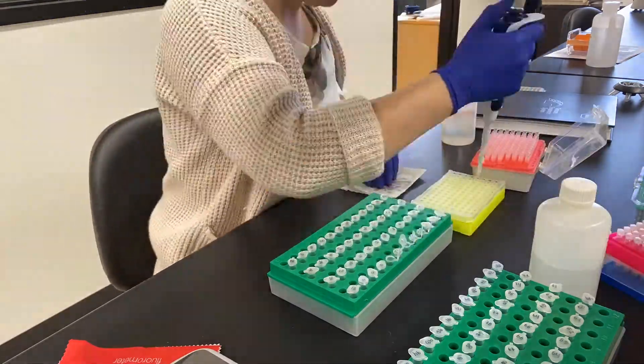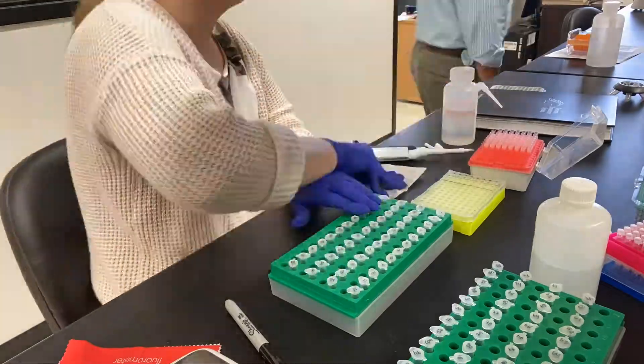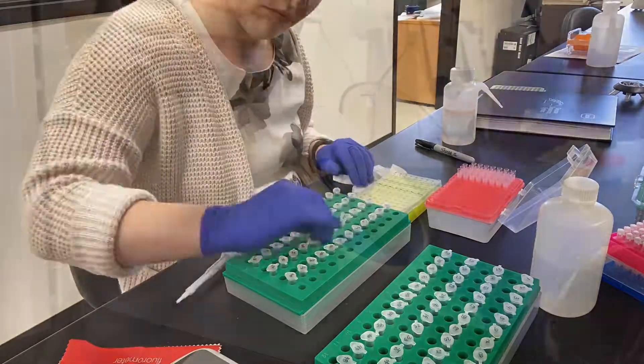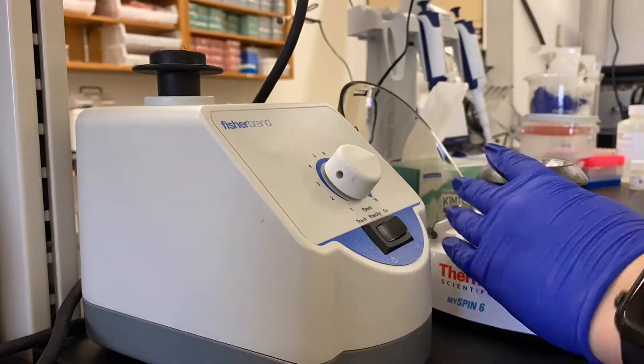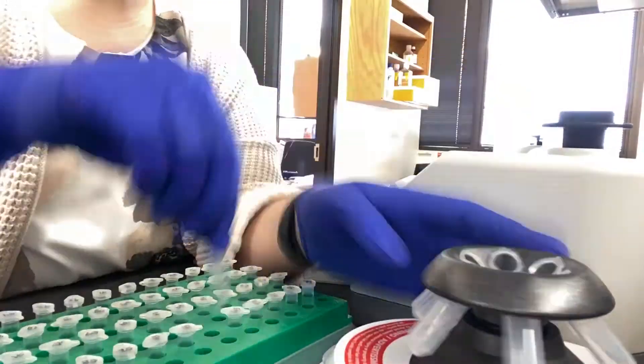After each tube receives the working solution I quickly vortex and spin down samples prior to loading two microliters into the assay. Each tube is then briefly vortexed and centrifuged, and once that is done we are then ready to read in our samples.